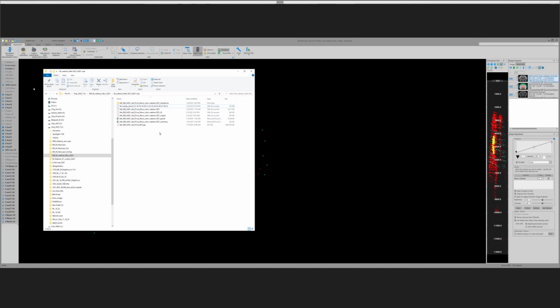Once Map Data to Atlas is done, it generates additional files. One is a file that contains the transforms that are used for each section, so that we don't have to go back and do this registration again if you come back to your material and say, oh, I really would have liked to mark the cells in this other region of the brain, or use different parameters to mark the cells in a different way.